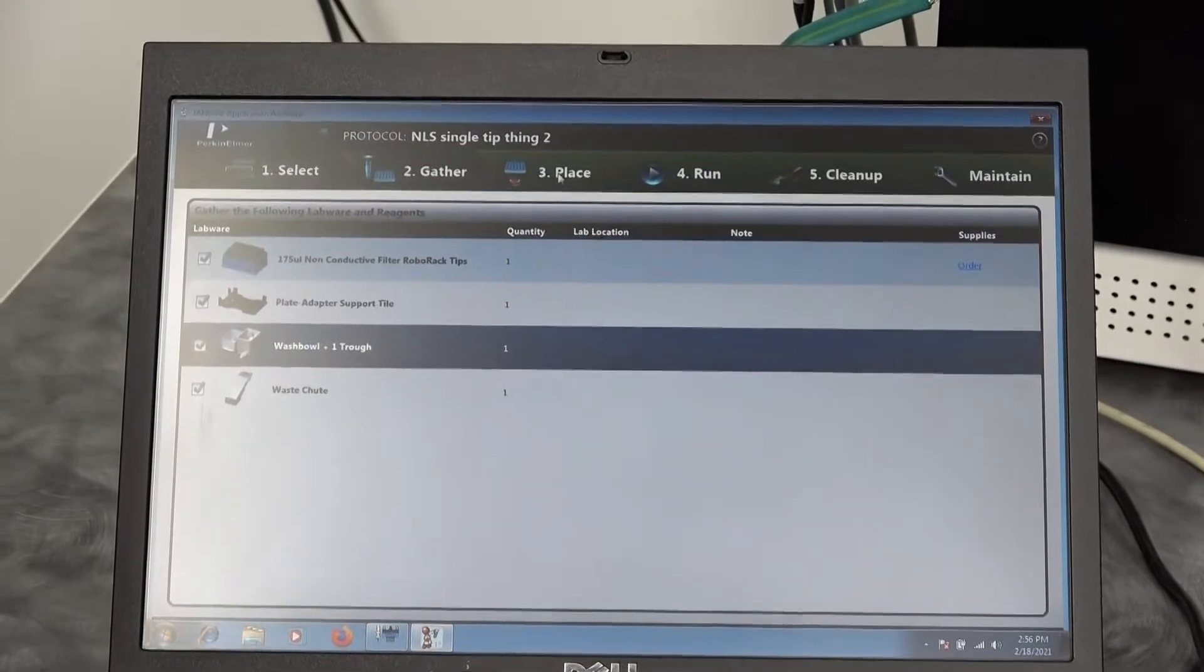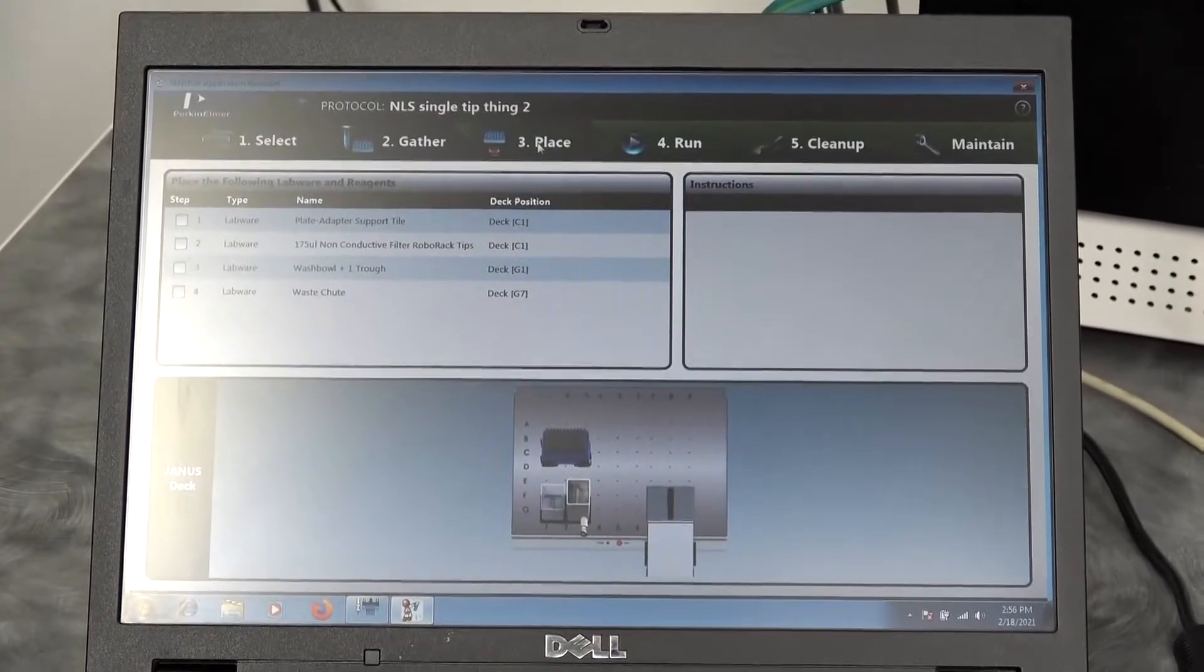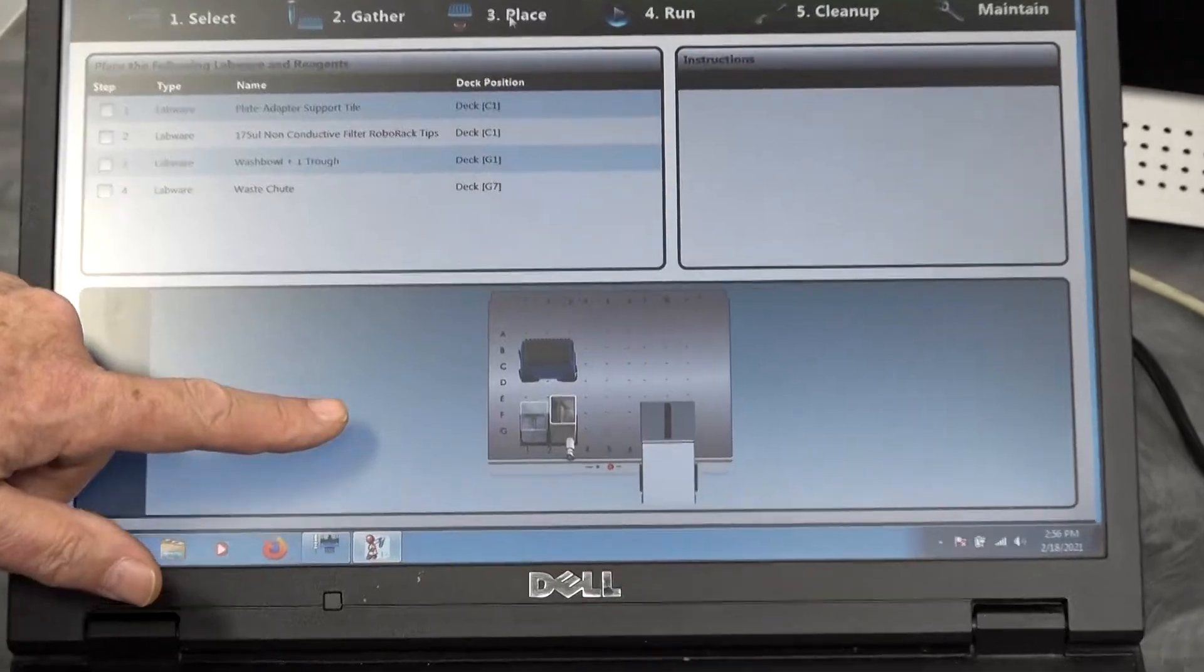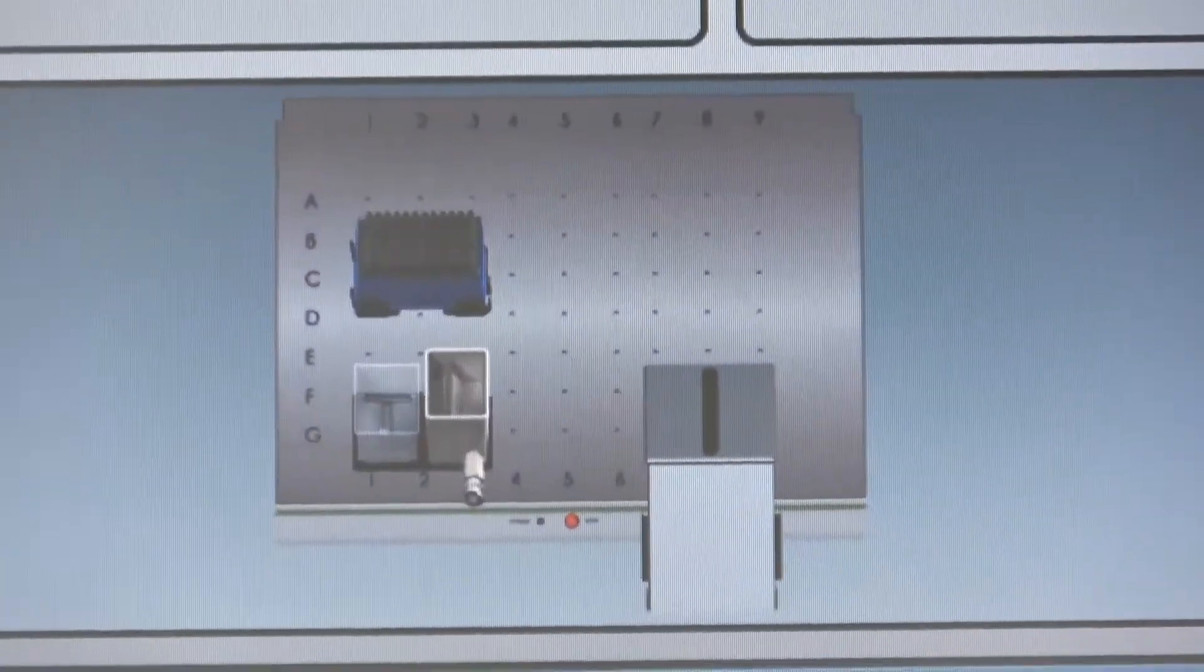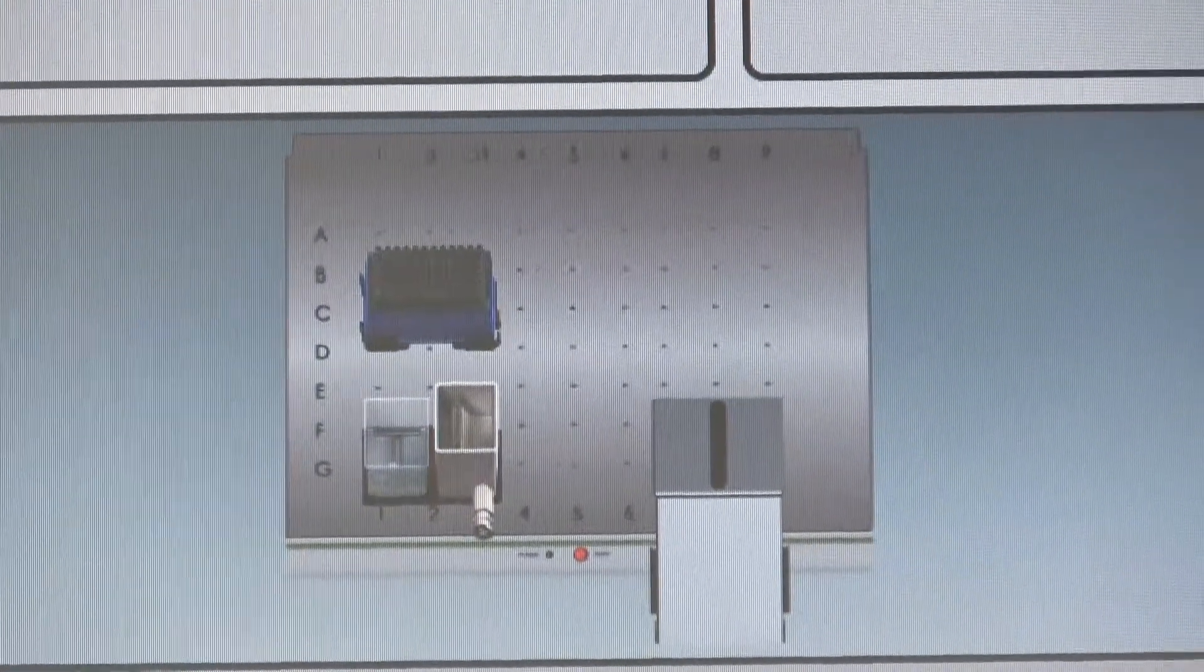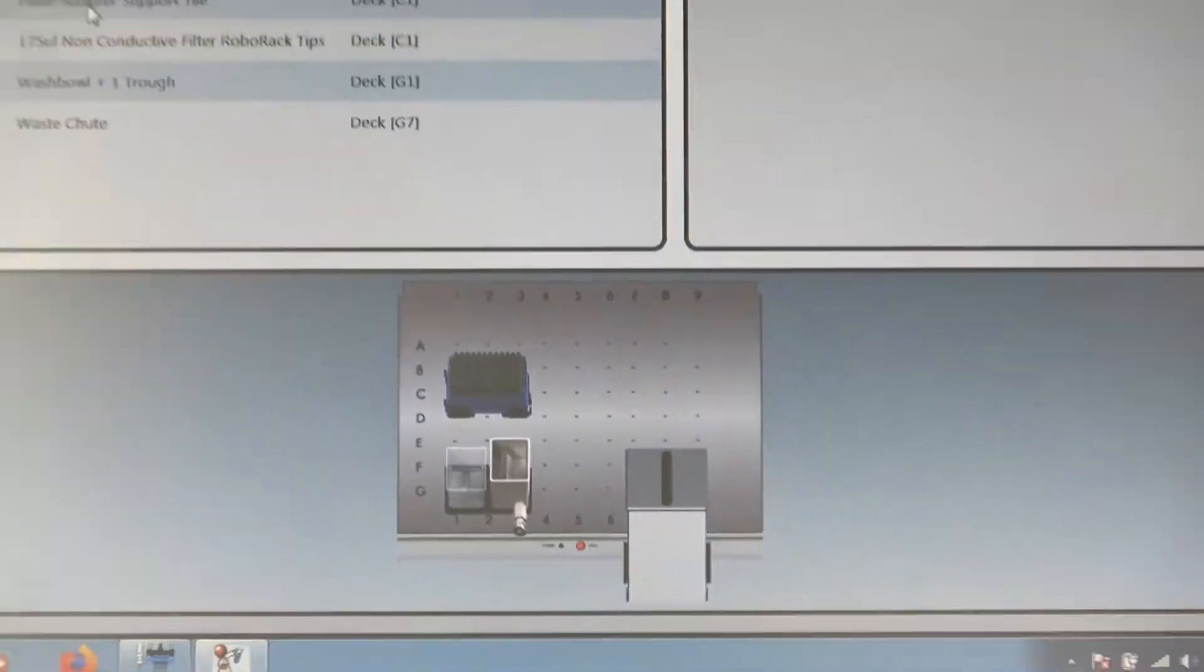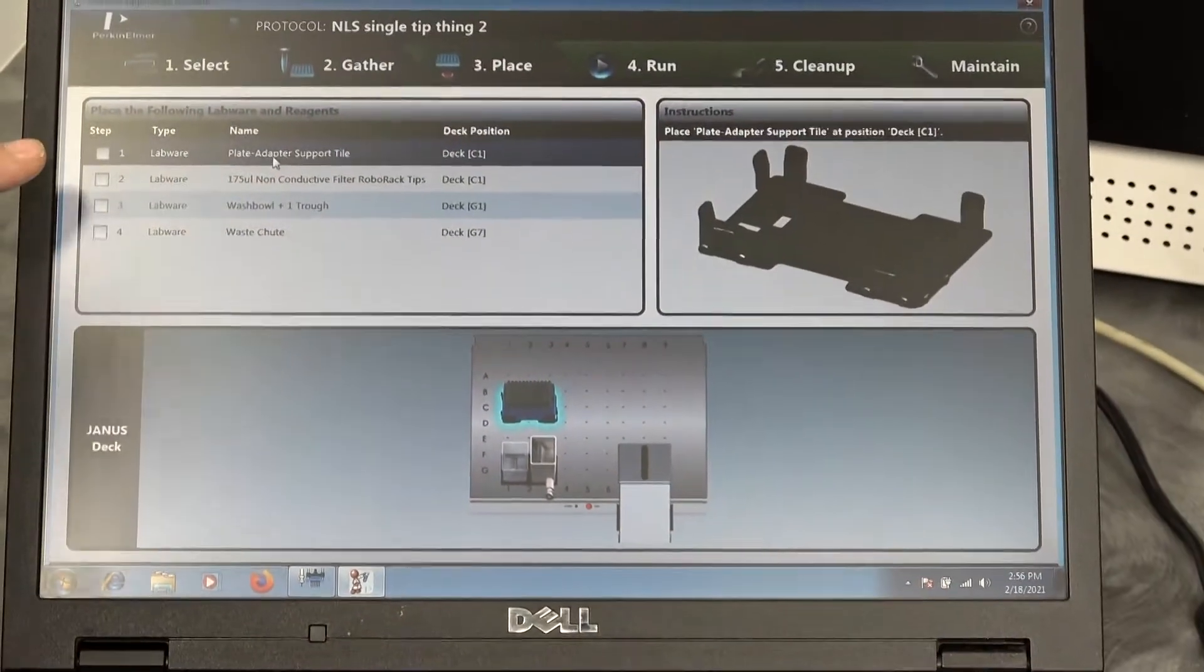When you go to the place section of the menu, it gives you a graphic representation of the deck and where everything goes. When the end user is ready to assemble it, they can click on the item.